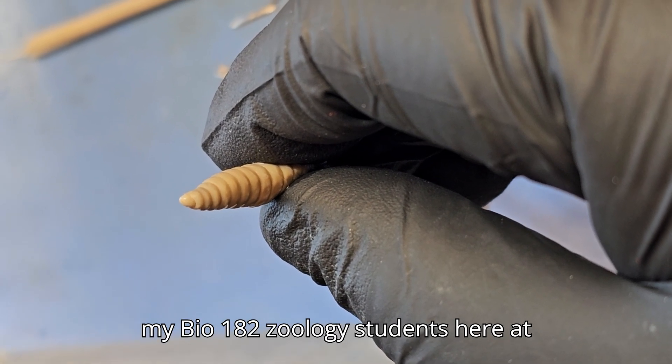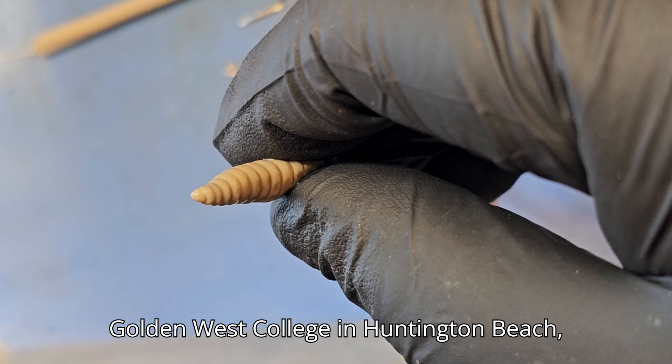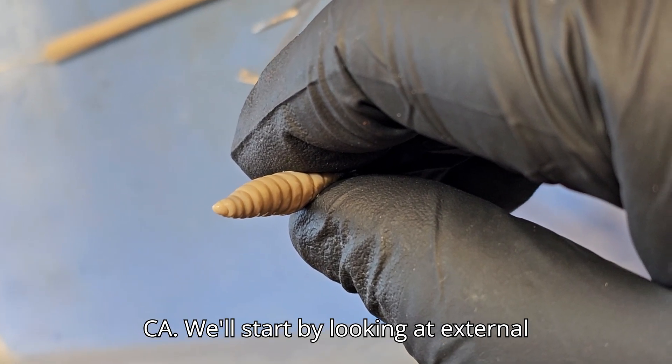Here we have an earthworm dissection for my Bio 182 zoology students here at Golden West College in Huntington Beach, California. We'll start by looking at external anatomy.